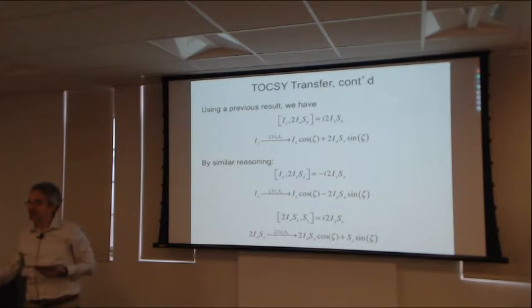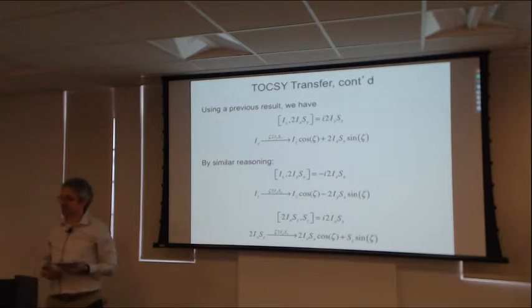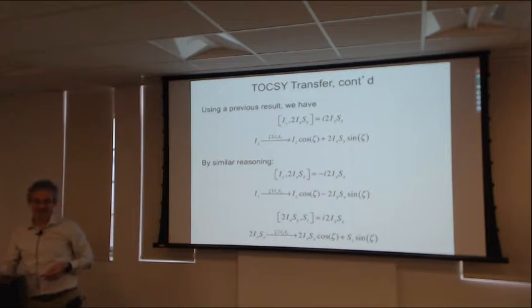In the beginning of trying to do these experiments, people had two ideas. One was just to turn on a continuous wave field, which is called spin locking, and the other was to do a train of 180 pulses with a very short spacing. And these both work kind of. They worked enough for people to get initial papers published, but not well enough to actually be useful.